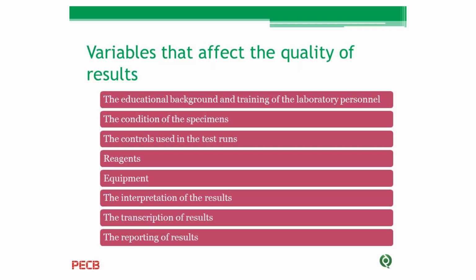It's personnel. The qualification of the personnel is one of the most important features. Sometimes, maybe from a quality control plan in the laboratory, we can identify the training needs in our laboratory. So we can see what is missing in our personnel that showed in quality control activities that we have some problems or some non-conformities in the laboratory.